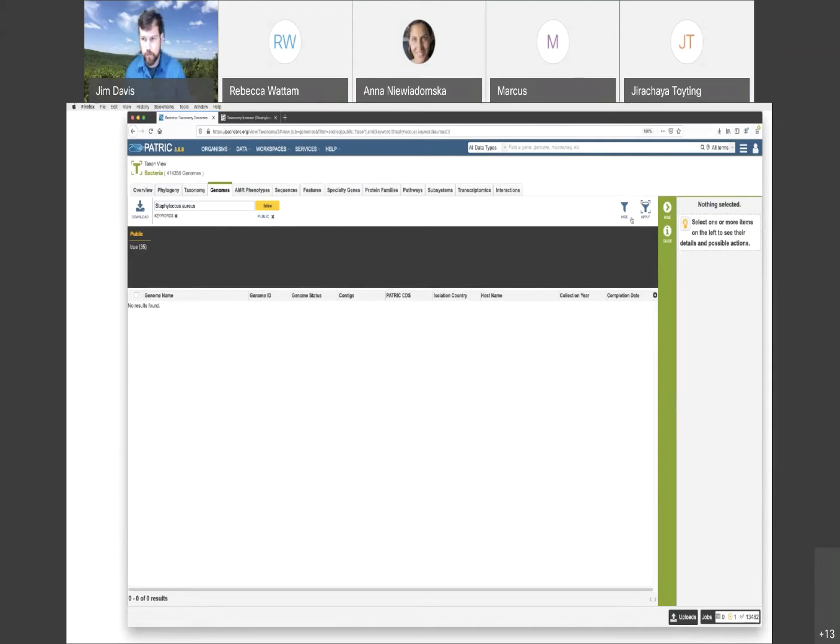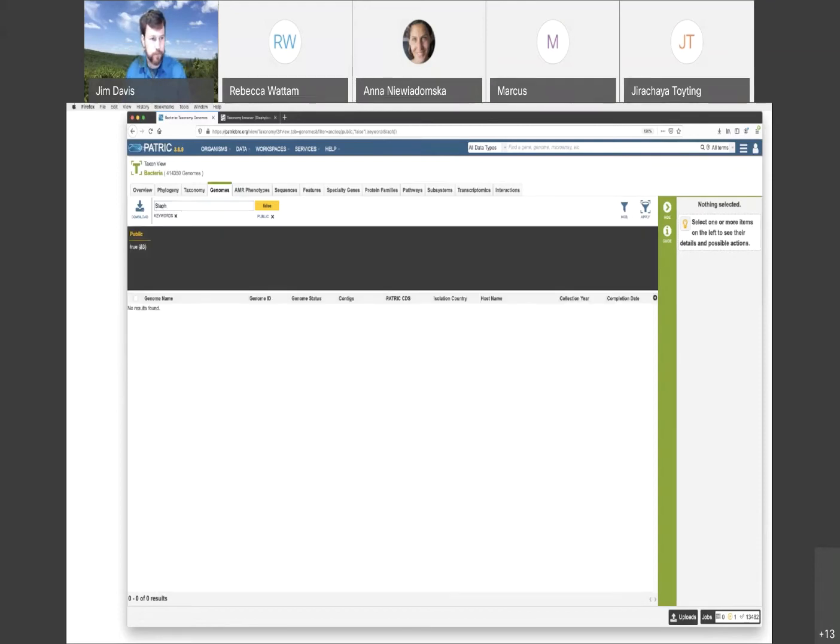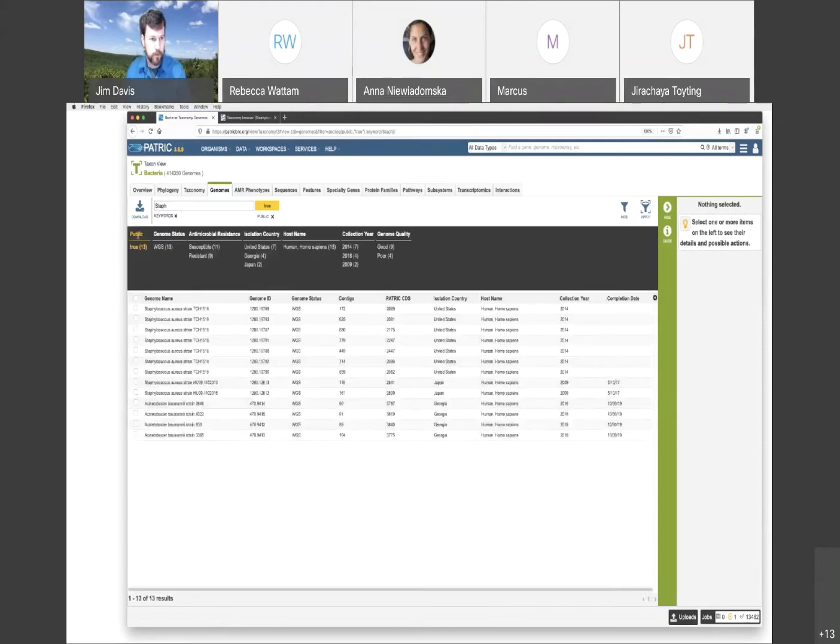I think I can't tell because it's too small, but I think you've misspelled Staphylococcus. But maybe I'm wrong. No, I had it right. Maybe I got the filter wrong. Public, true. Well, I'm not seeing it here.